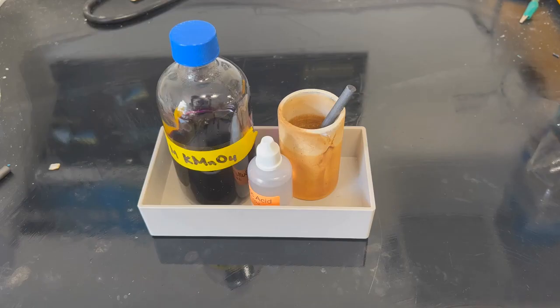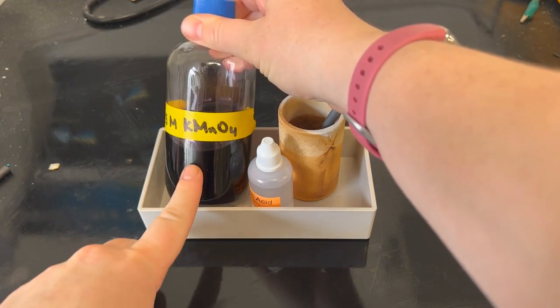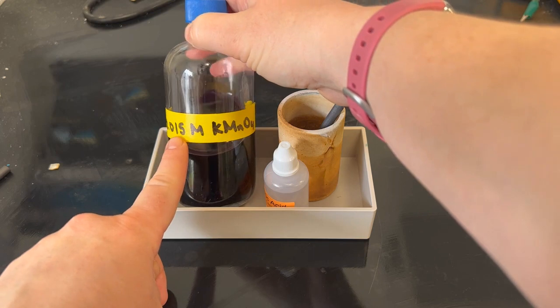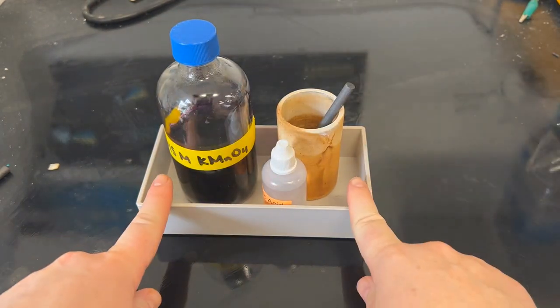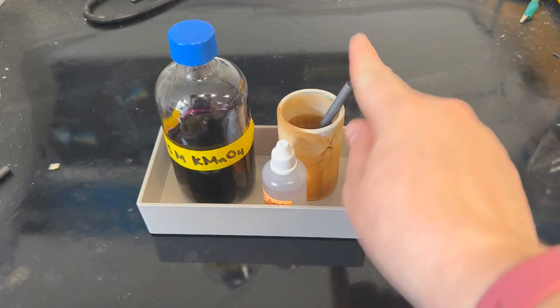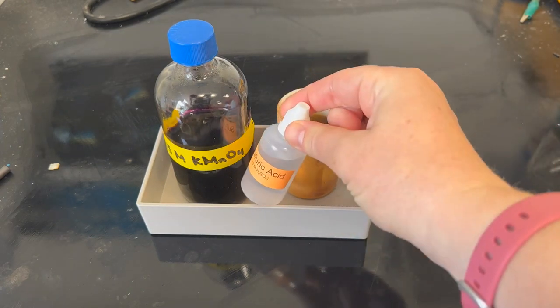The special chemical that you are using is potassium permanganate. We have used this before. Today's solution is 0.015 molar potassium permanganate. So you'll get your tray with the potassium permanganate, and it's got in it a porous cup, a carbon electrode, and a little bottle of sulfuric acid.